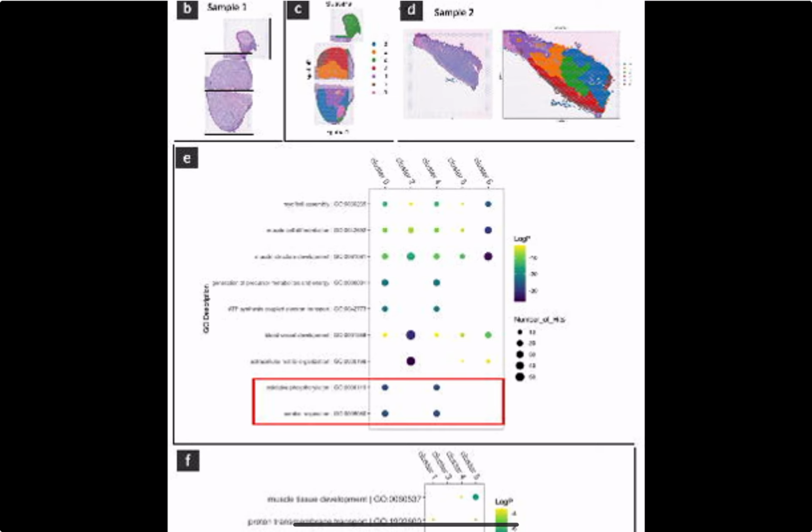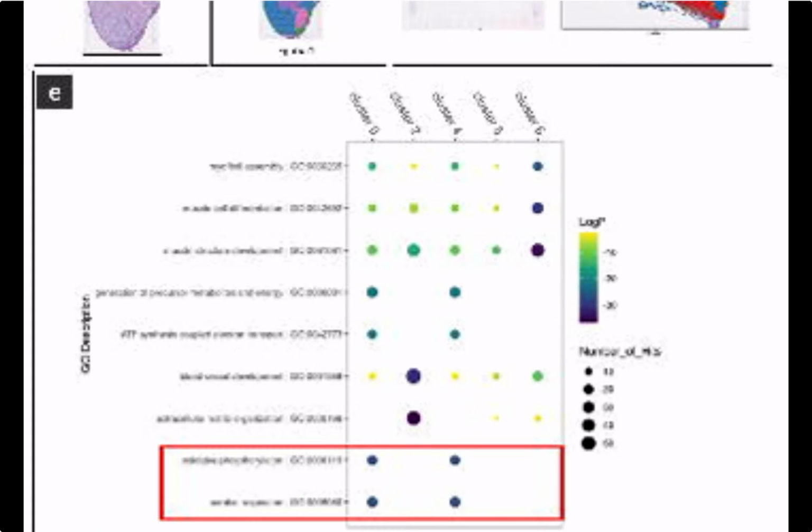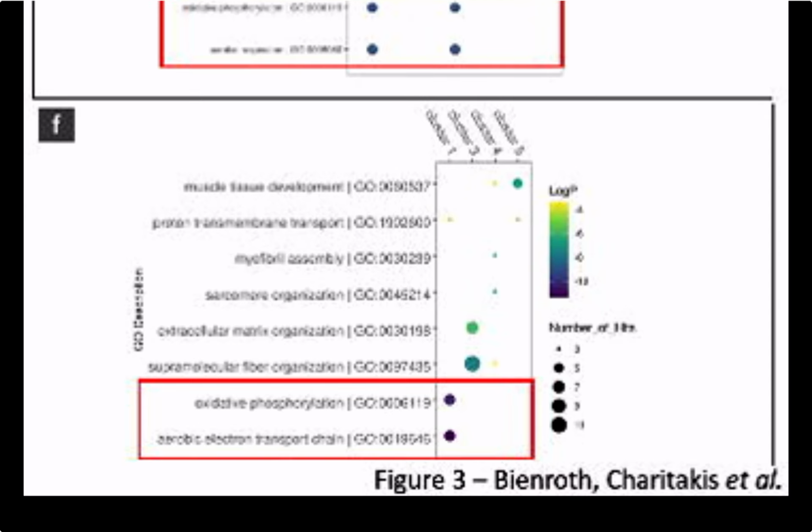Using the same analytical pipeline, this additional sample from MCH-TB302 displayed the same signature for upregulation of pathways related to aerobic respiration in clusters located in the center of the tumor. Figure 3f. Therefore, we demonstrate that VR-Omics provides a unique capacity for analyzing coplanar datasets to explore novel biological mechanisms in rare tissue sections.